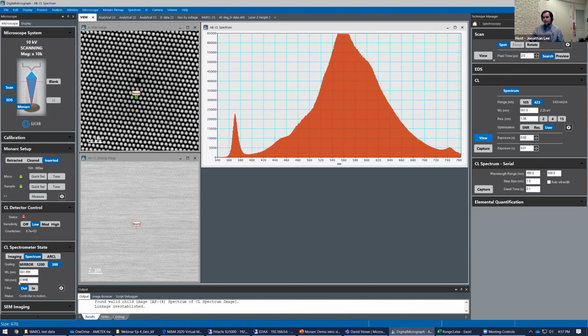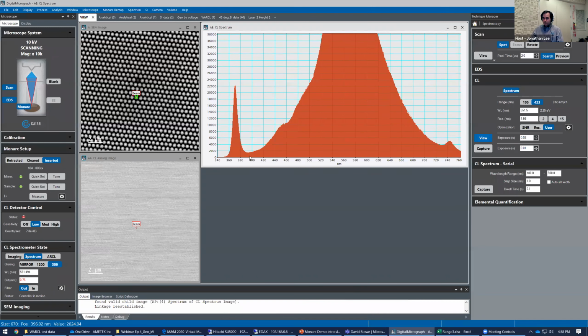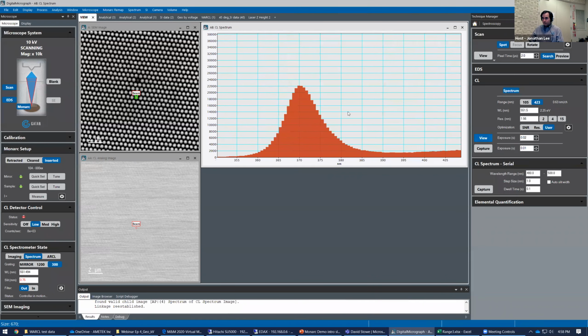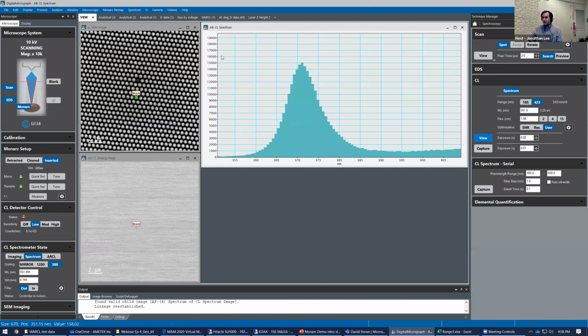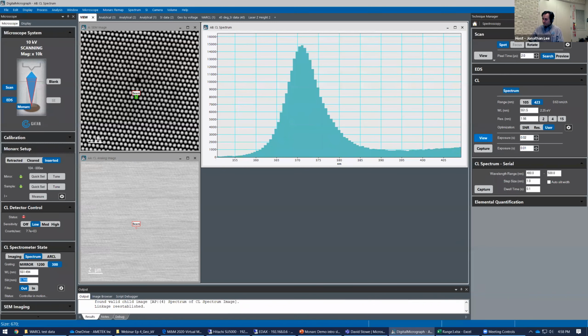As you shrink your slit size, you might see it change shape a little. But going from 1 to 0.75 did nothing. It doesn't look like much happened there, so we can go even smaller.